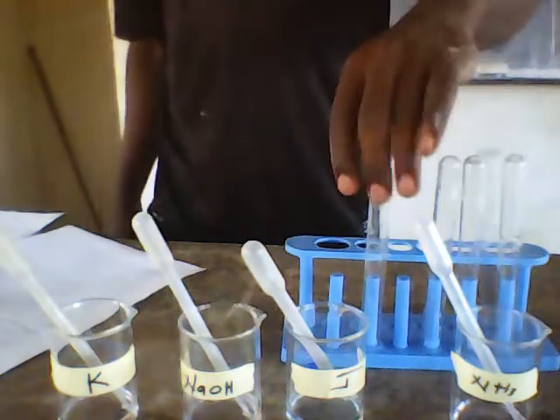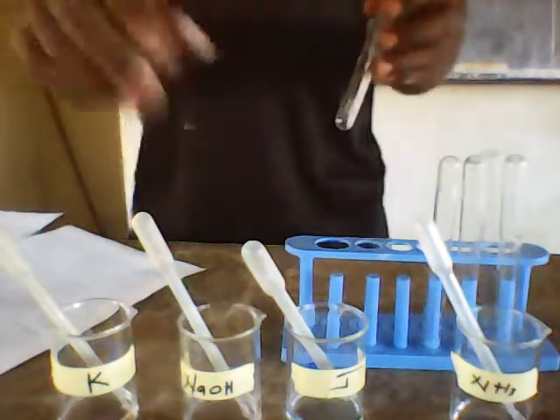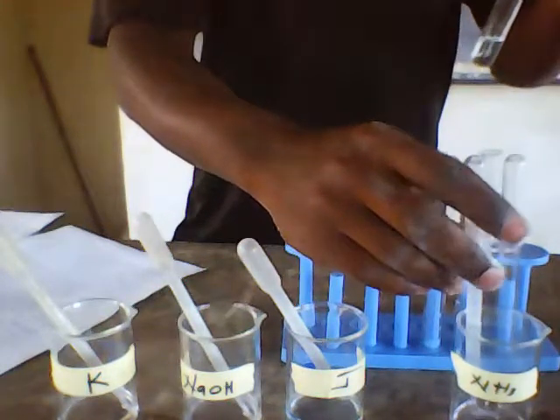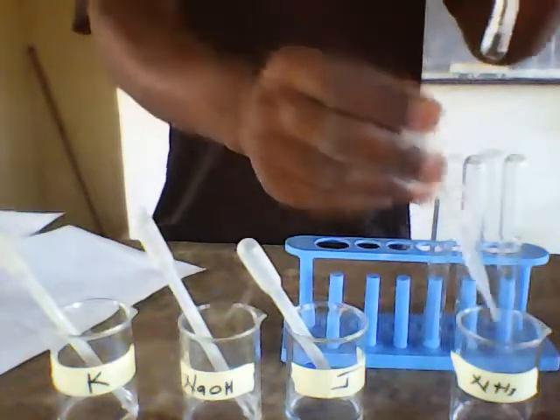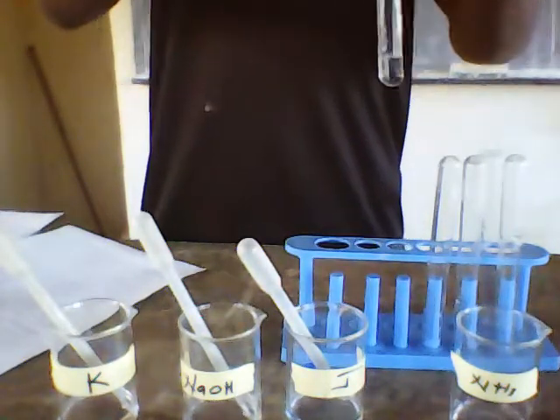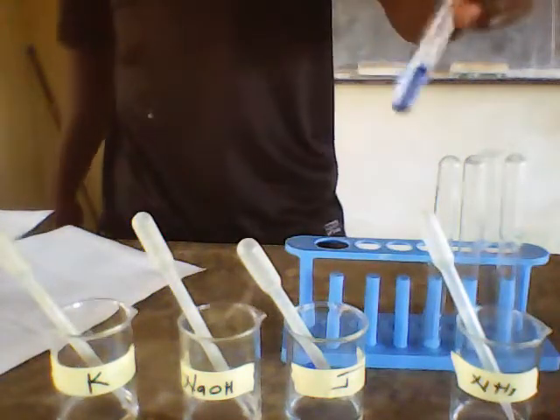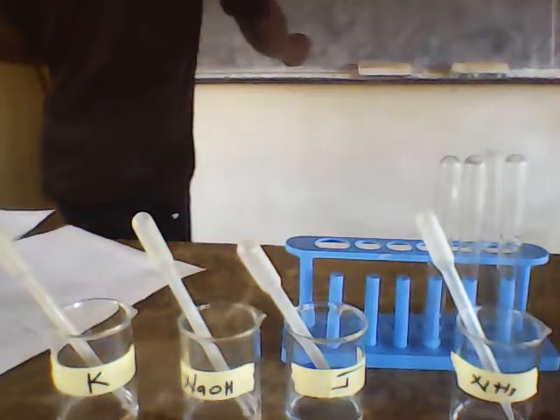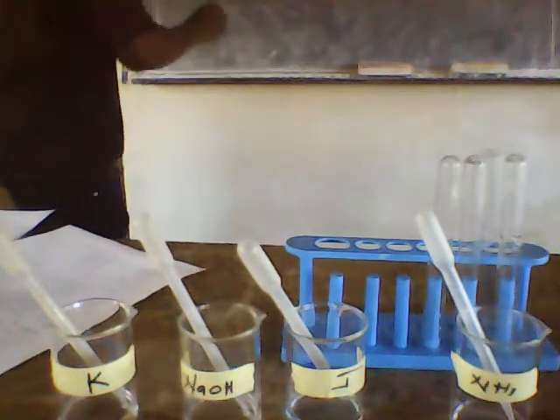Then I'm going to get another clean, dry test tube. I'm going to place a small portion of solution J into the test tube. Then I'm going to place a small portion of ammonia into the same test tube. Here my observation is that I'm getting a blue precipitate. So I'll write it down: a blue precipitate was formed.